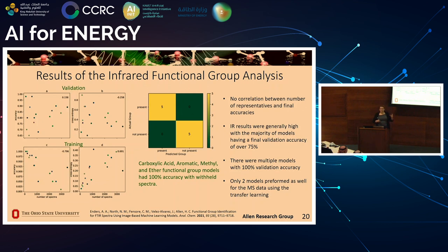So what we did is we fixed most of those nodes, and we retrained the last layer on our data to see how it would do. So this is our results from our IR study.